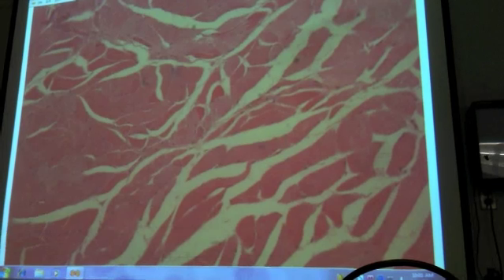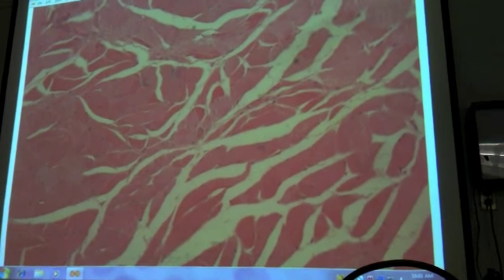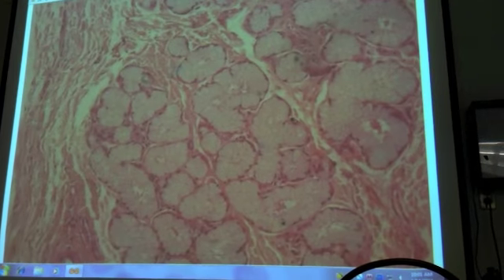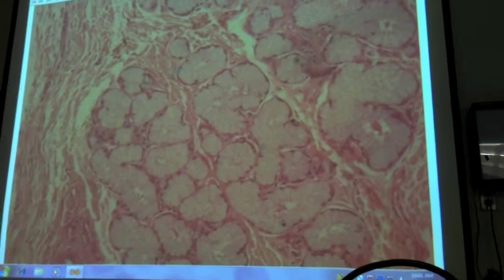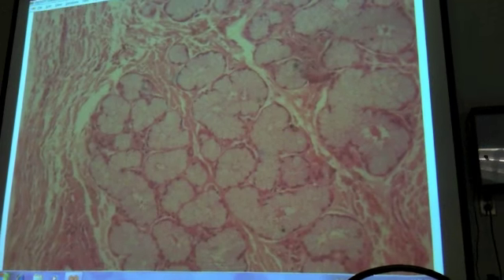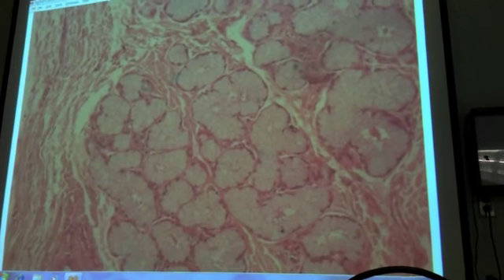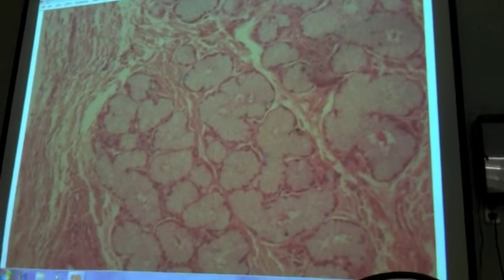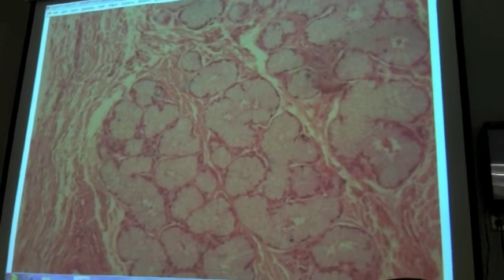Now, I heard smooth muscle, yes? Can we go back to, what was the name of the gland? Esophageal glands. So, do you have your lab study guide? We're looking under esophagus, and everything's listed that's unique regionally here, and then any of the layer names and sublayers above.